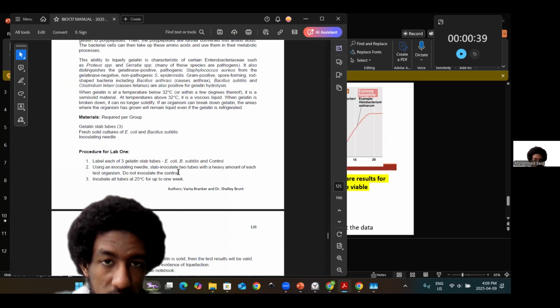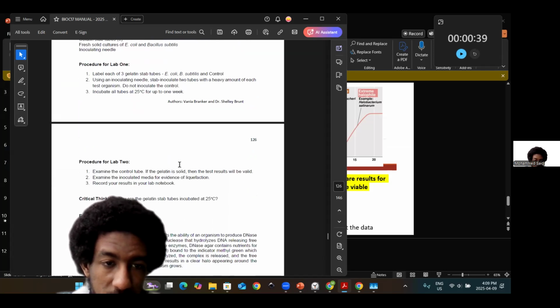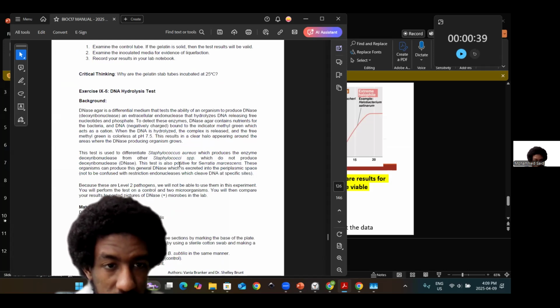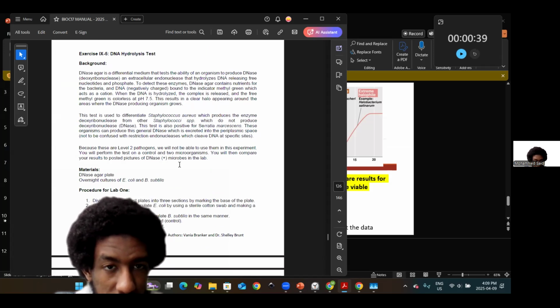Interestingly, there are other bacteria that you may want to know, like anthrax, for those that are involved in anthrax. Yeah, DNA hydrolysis. We have other sets of bacteria that we're using, right? E. coli, B. subtilis.